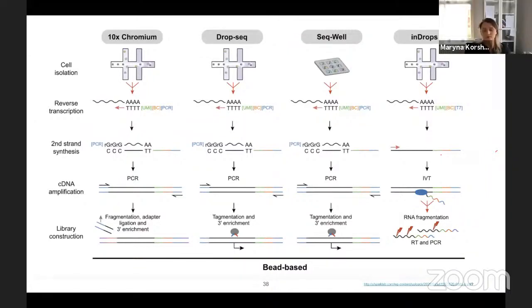There are several protocols available for the sequencing of other types of RNA. Instead of using poly-dT tails, you can use a randomized set of random primers, so you use these structures without a poly-dT tail. I recommend you go to SmartSeq protocols, as I remember it's the most relevant one, or just please contact us in this Slack and we will provide you with these materials. I also remember that several protocols were linked to the discovery of circular RNA and other types of minor RNA that you might be interested in. So protocols are available, but we will not cover that in our course in Tensil.